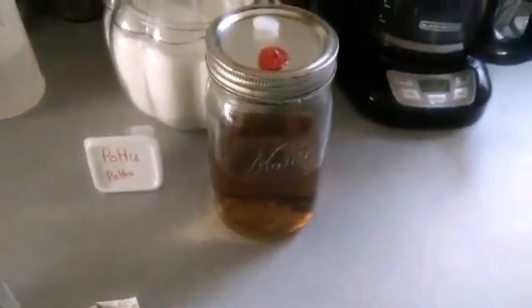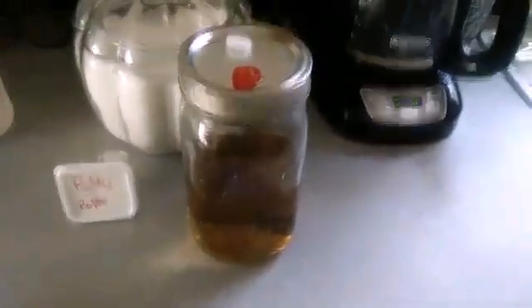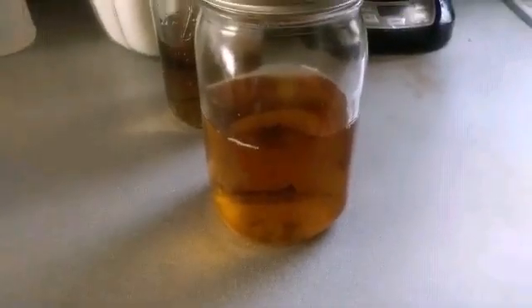I just pulled it out of my warming box. It's been three days and there we go — we have liquid culture. Look at that mycelium!